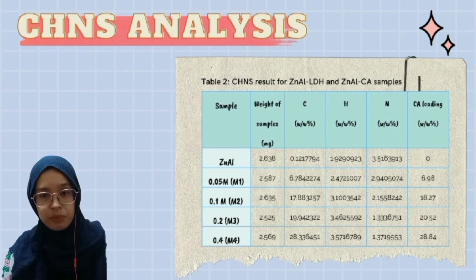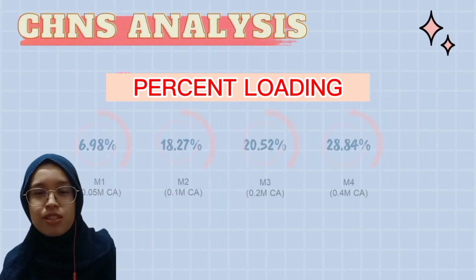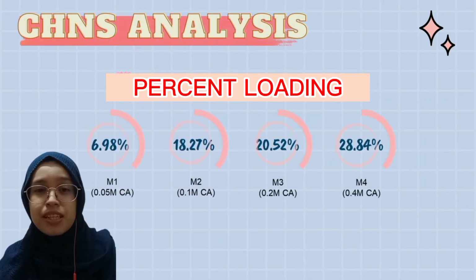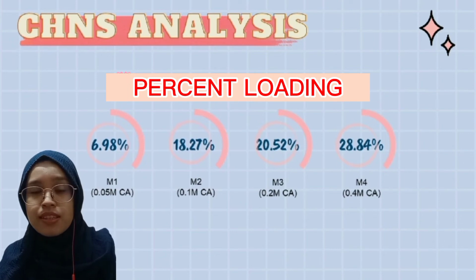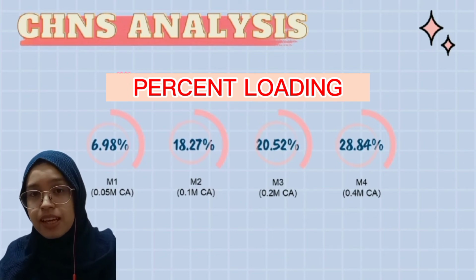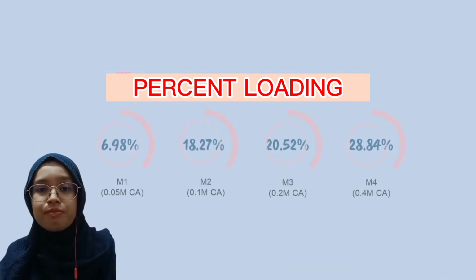This has supported the result from the PXRD that shows there is co-intercalation of nitrate and cinnamic acid anion. And as the concentration of cinnamic acid increases, the percentage of carbon also increases, which shows more cinnamic acid intercalated into the zinc aluminum LDH. And we can see that the percentage intercalation of cinnamic acid also increases as the concentration of cinnamic acid increases, from 6.98% in 0.05 mole cinnamic acid to 28.84% in 0.4 mole cinnamic acid.